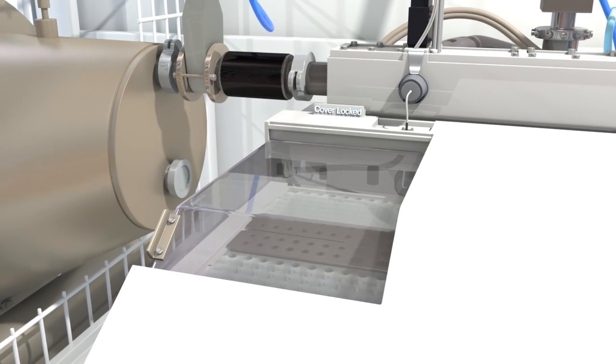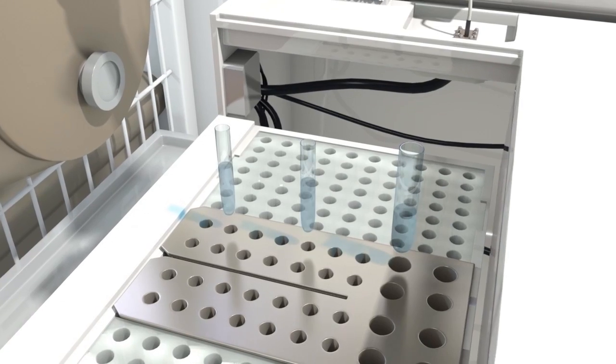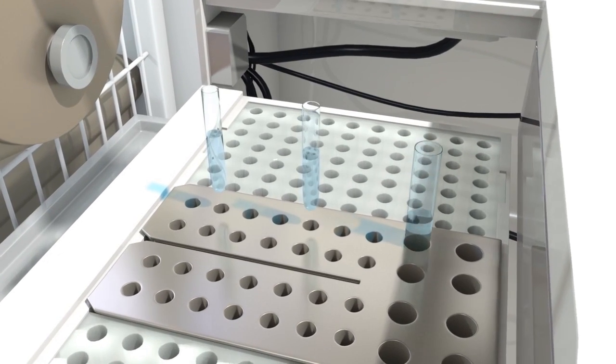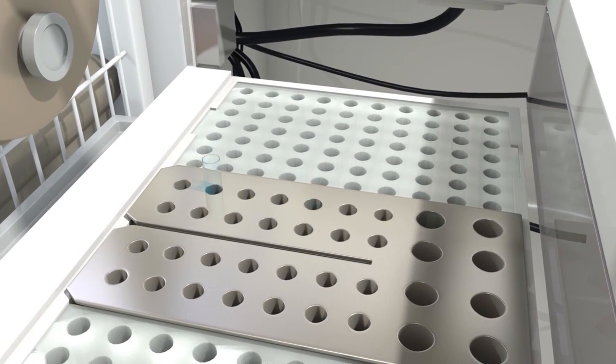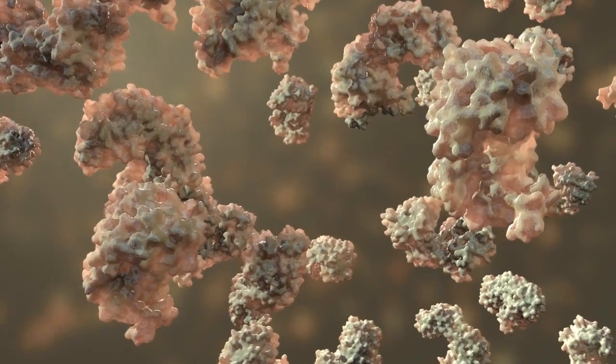A SAXS experiment starts with loading a liquid sample into the sample loader, which may contain any type of macromolecule that we want to study. In this example, the sample contains proteins, of which shapes will be probed by a highly focused beam of X-ray radiation.